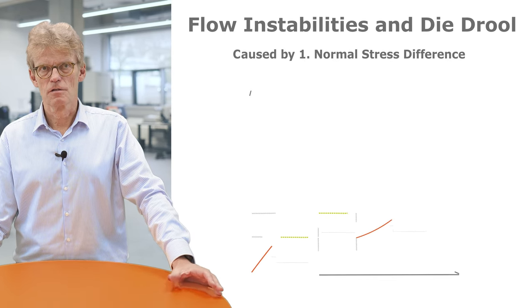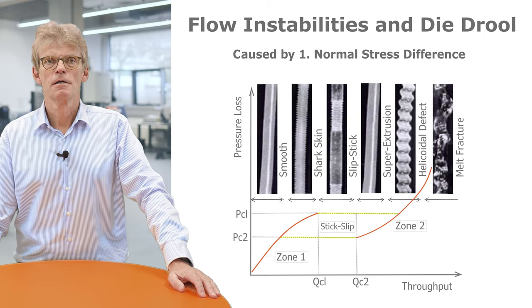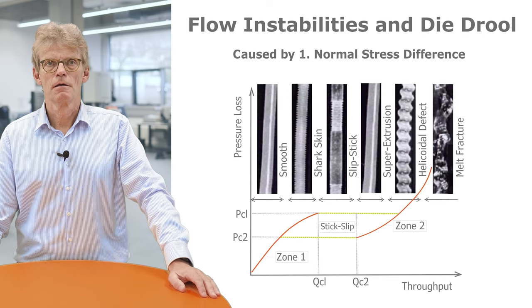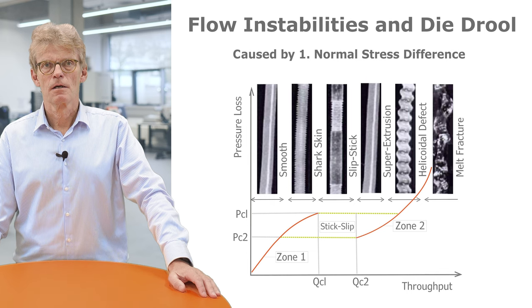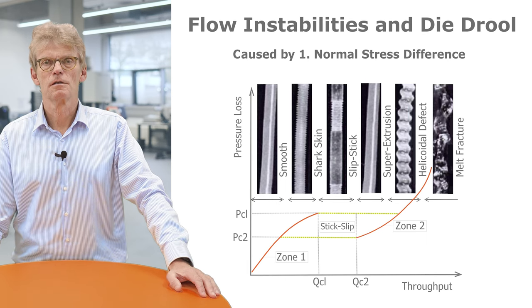Flow instabilities occur when you increase the throughput by extrusion. First it starts with a smooth extrudate, and then the so-called sharkskin effect is occurring, and the onset can directly be related to first normal stress difference.